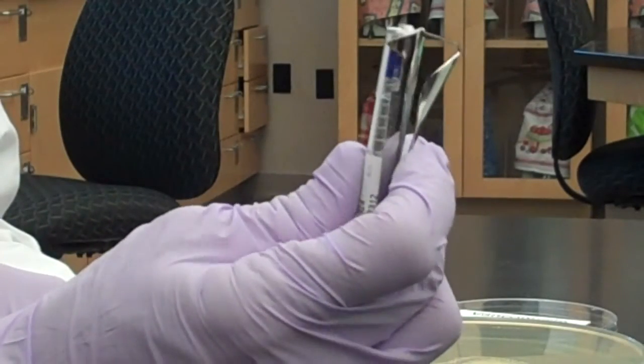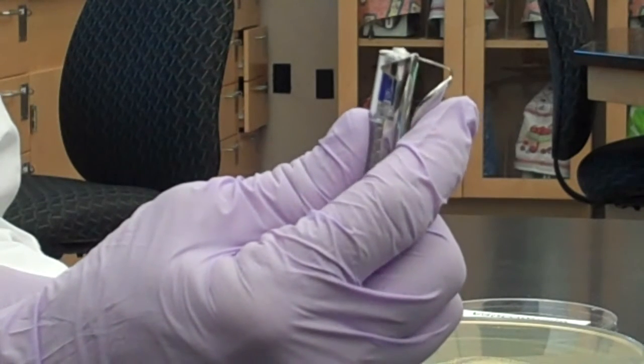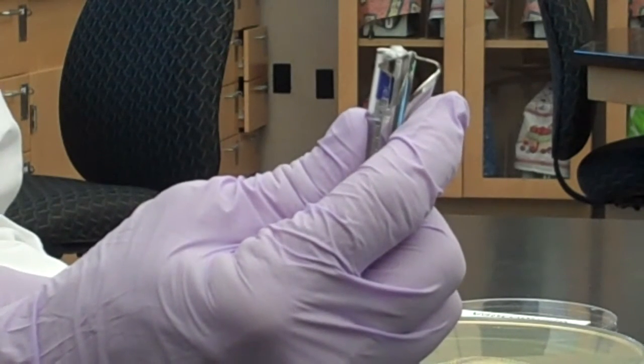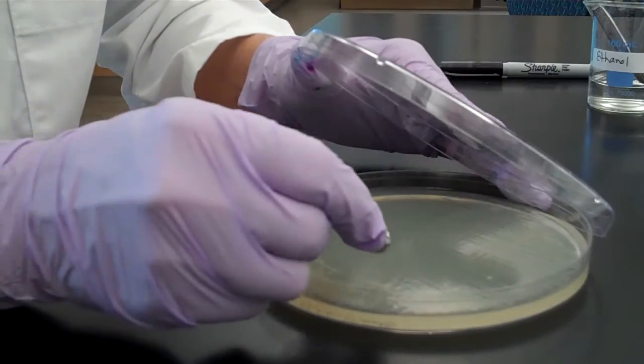The antibiotic disc dispensers kind of work like a PEZ dispenser. There's a silver plunger that will push the disc out onto the plate. Dispense an antibiotic disc from the disc dispenser.